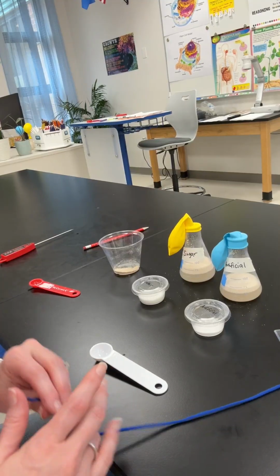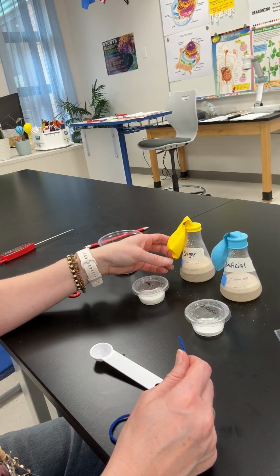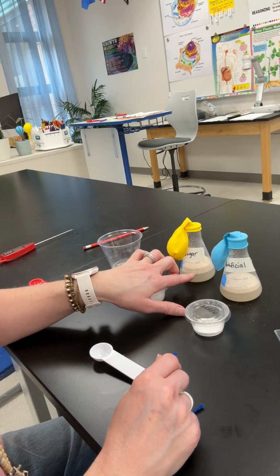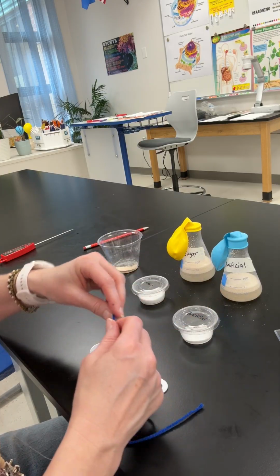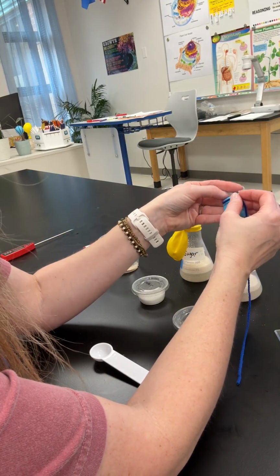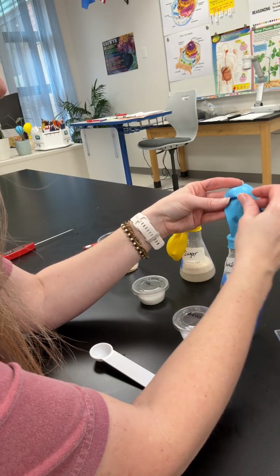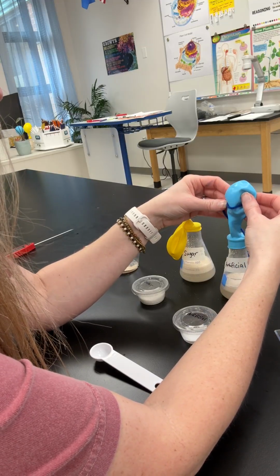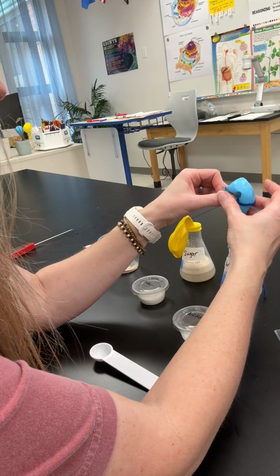Okay, it's been 5 minutes, so we're going to check the circumference. Just by looking at it, you'll notice that there's a lot more bubbles, which means there's more gas being released from the sugar than the artificial sweetener. This really should be done with 2 people to get it more accurate.